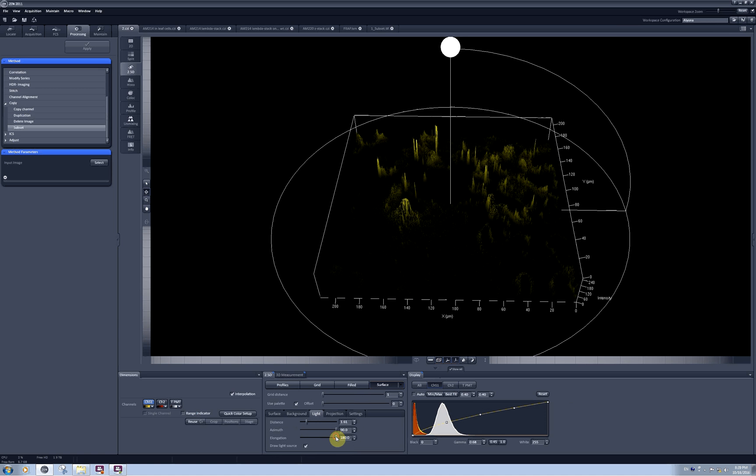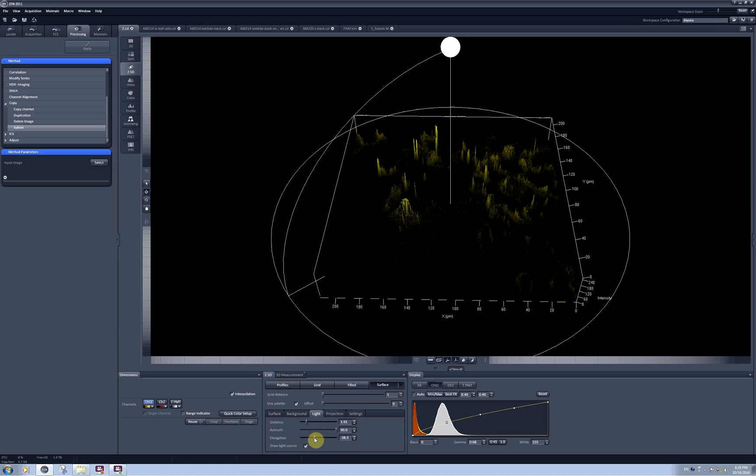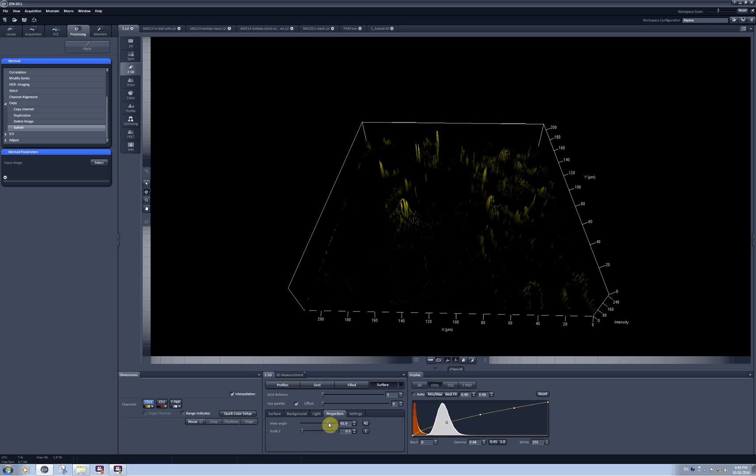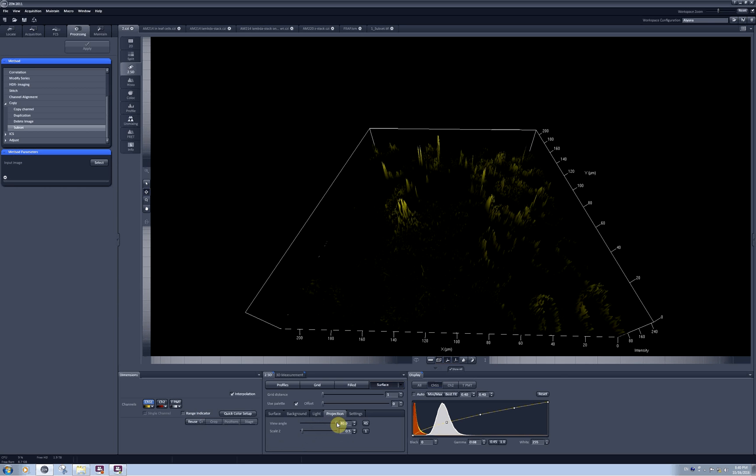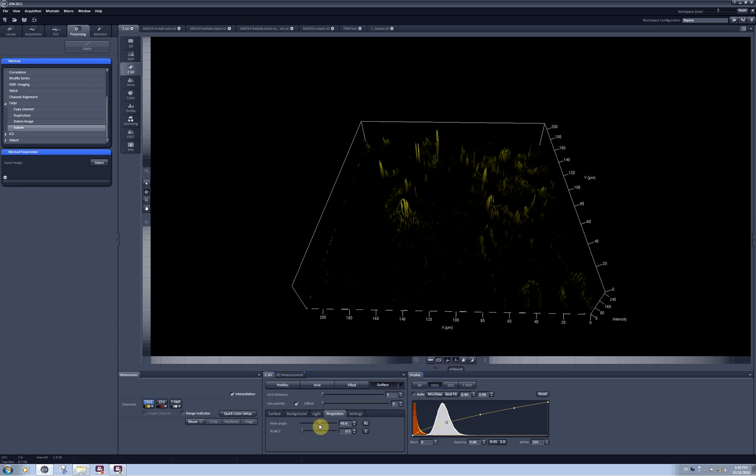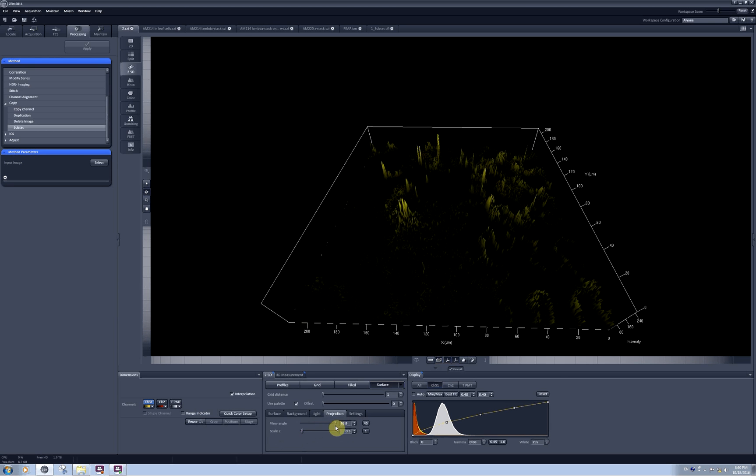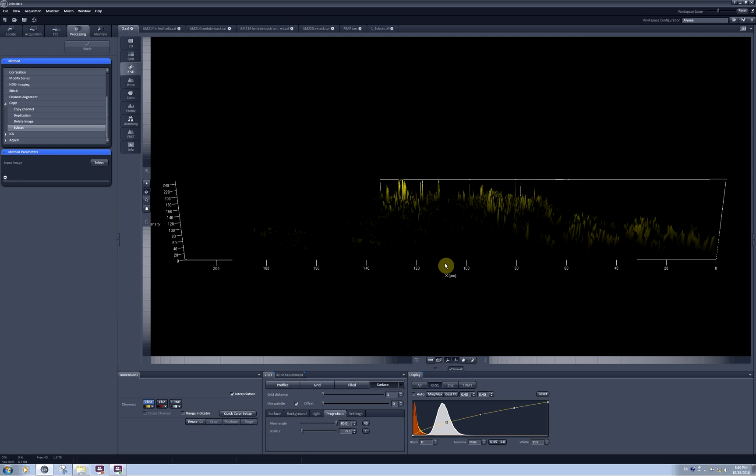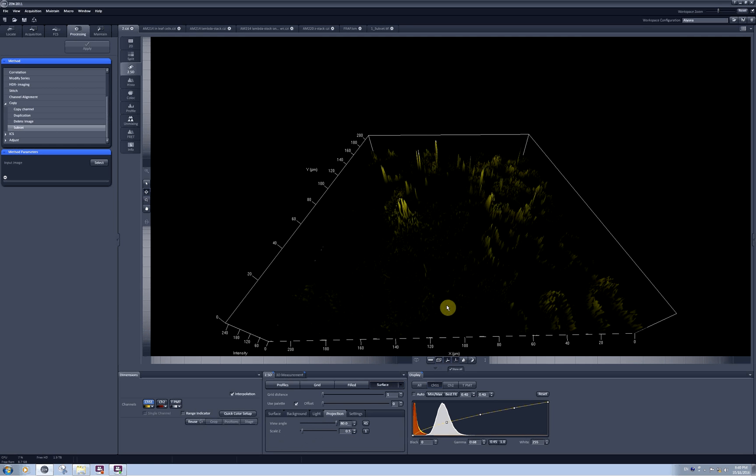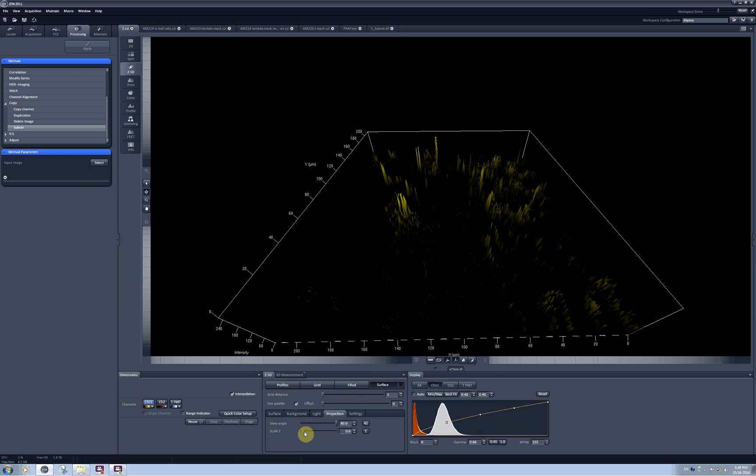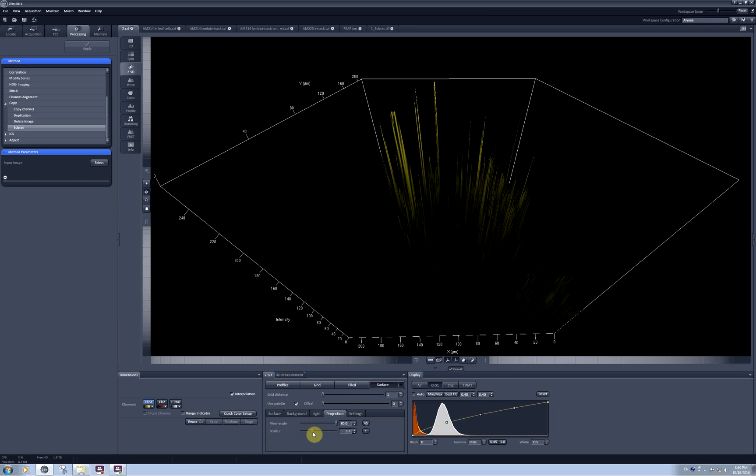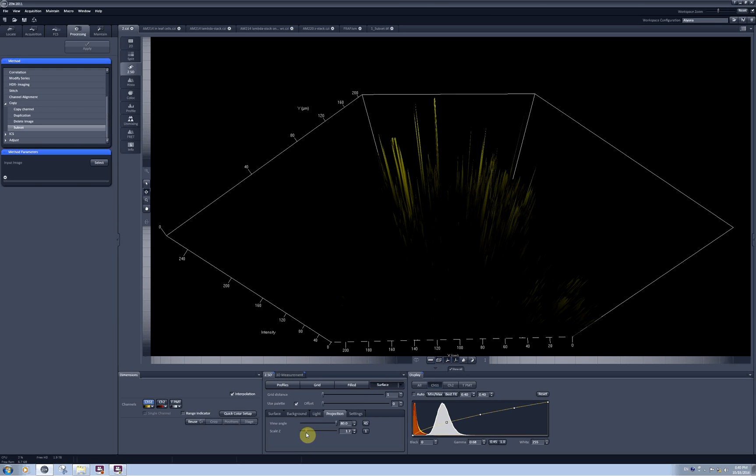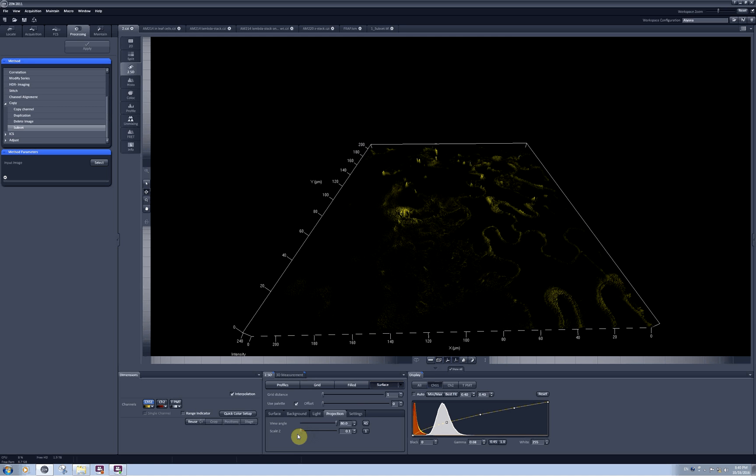And I also can change the elongation. In the projection tab you can create a different perspective by tweaking the view angle. And you can also rescale the height of the z-scale making it either larger or smaller.